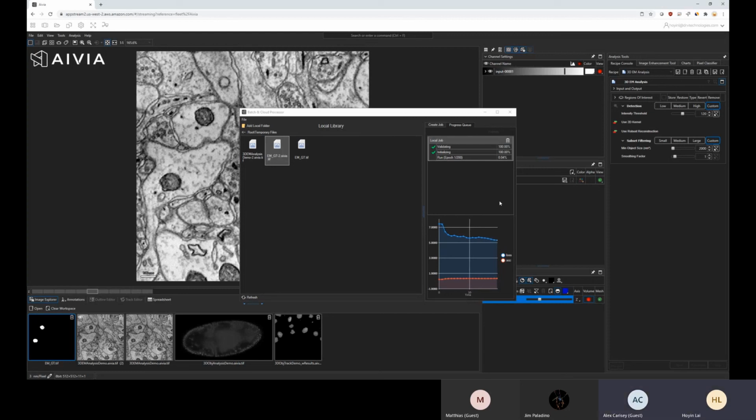I just have a quick question. So all your images must be the exact same dimensions, right? Yes, absolutely. Okay, sorry, I take that back. Each image pair needs to have the same dimension, but each image does not have to match the others.